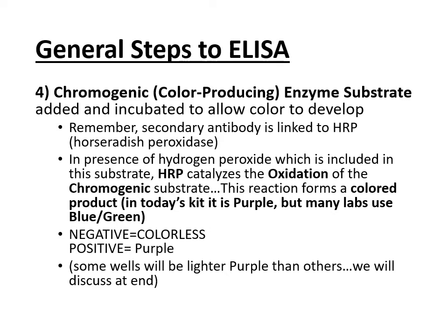Now you will notice that some of the wells might look lighter than others. And I'm going to want you in the post lab to analyze why you think that is. What I want you to think about is, well, what's causing the purple color in the first place? And once you realize what would cause the purple color, the exact scientific immunology reason for that purple color, then maybe you can start to think about why some will be lighter or some will be darker reactions than others. Okay, I'm not going to give you the answer because I want you to do some critical thinking in today's lab. Okay?